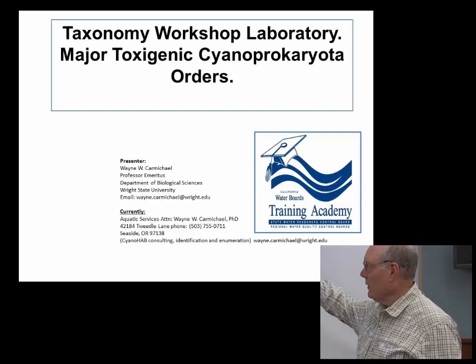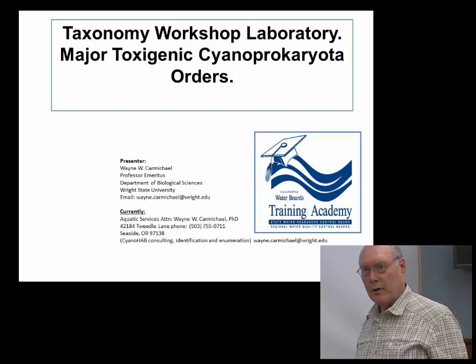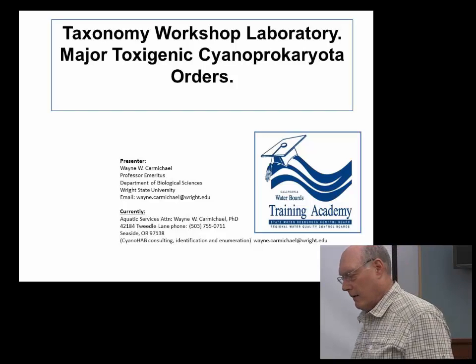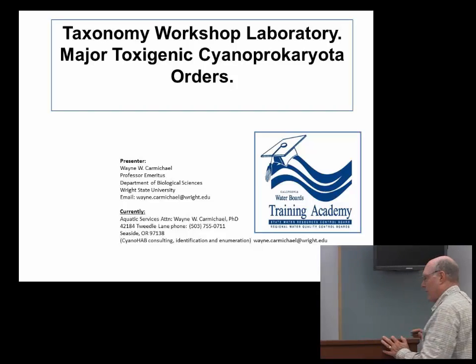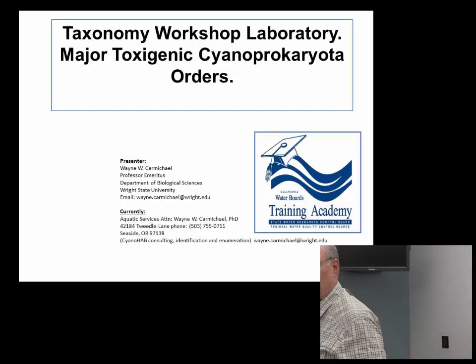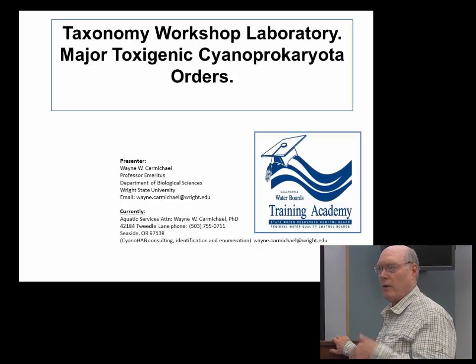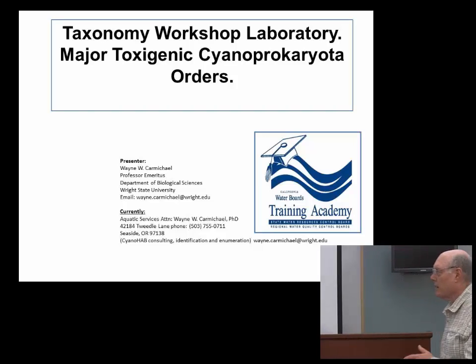So what I want to do is to show you the major toxigenic orders and examples within those orders, and then have a few samples for you to look at. And then, as I said, I've got some keys. I don't have 40 keys, but I've got 15 or 20 keys, so you can work. Or if you don't want to run the keys, you don't have to. You can just look at water samples.